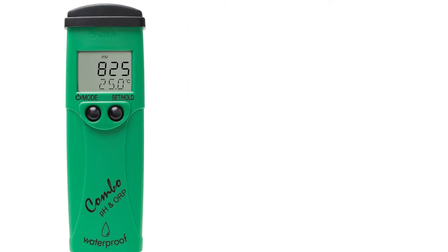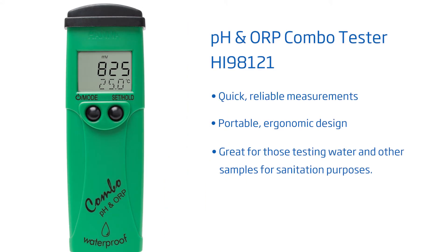Hi everyone! I'm Cassandra with Hanna Instruments. Today we're going to go over our pocket pH and ORP tester with replaceable probe, the HI98121. This advanced waterproof tester is perfect for any business or hobbyist that needs quick, reliable, and highly accurate measurements for water samples.